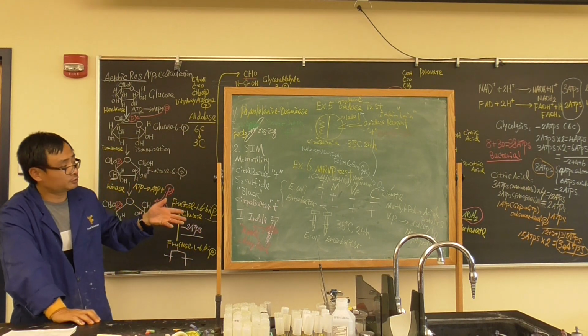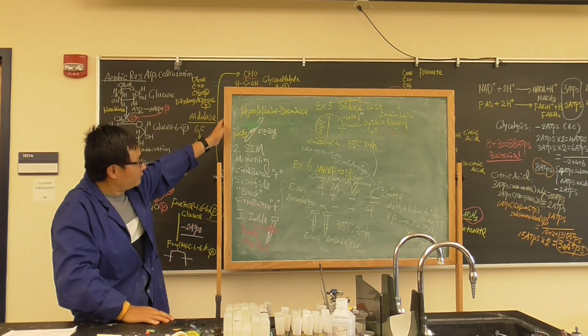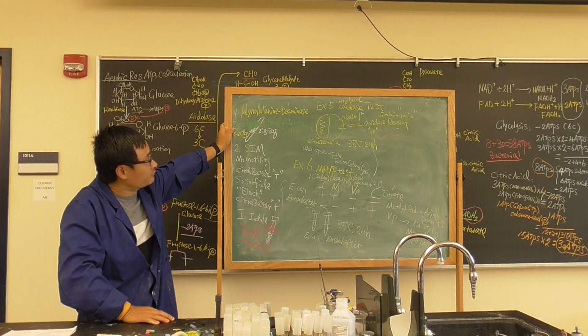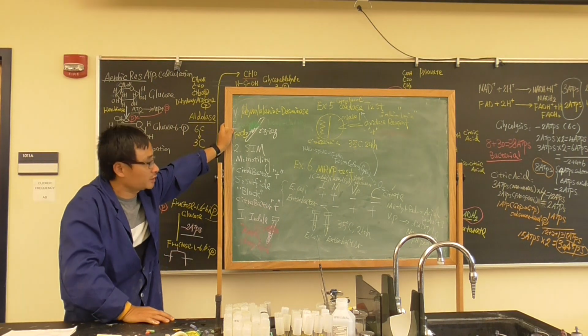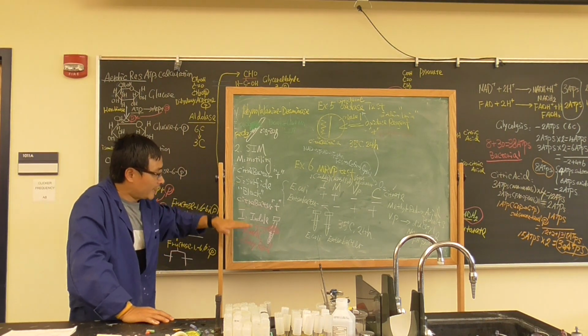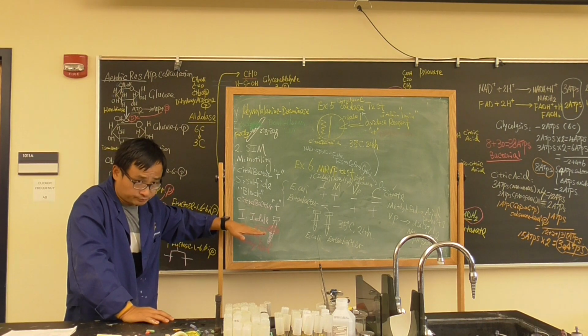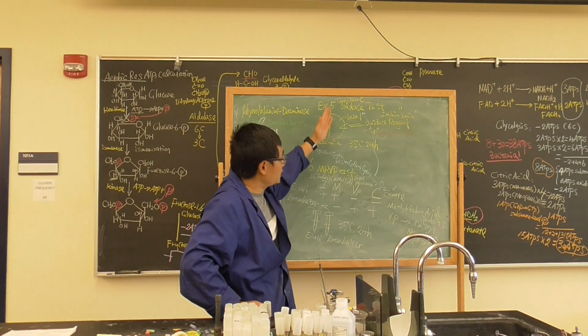Okay, so today's lab work is very simple. 2 items. Everybody add a drop of ferric chloride to identify whether your sample is positive or negative. If you see dark green, it is positive; otherwise it's negative. Add Kovac's reagent on top to see whether the indole test is positive. Have one nutrient agar, split it into two.